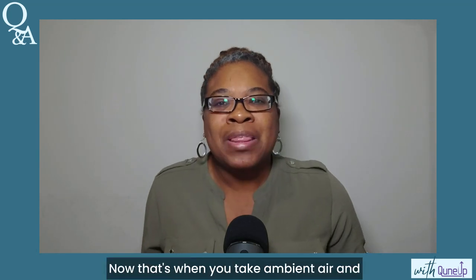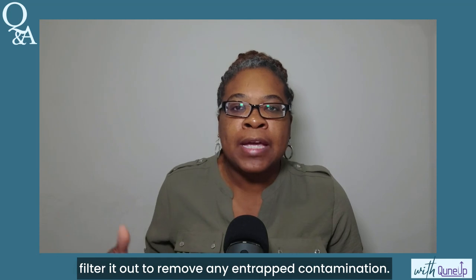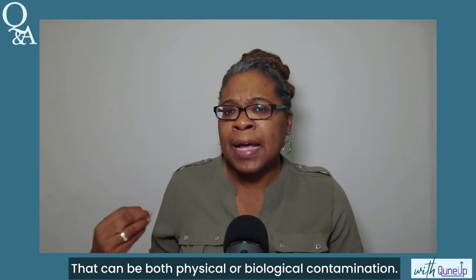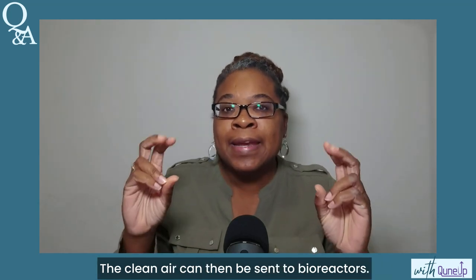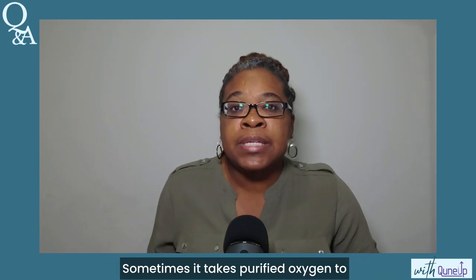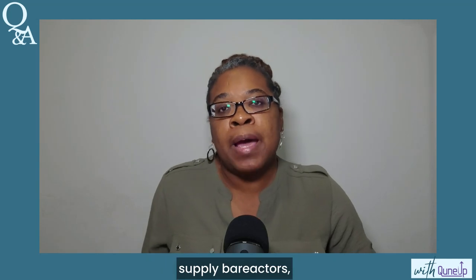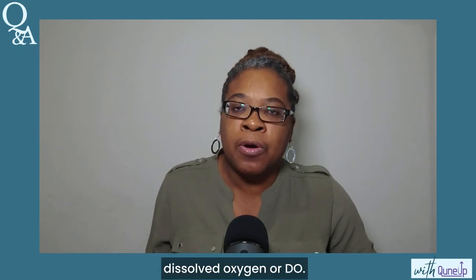Process air. Now, that's when you take ambient air and filter it out to remove any entrapped contamination. That can be both physical or biological contamination. The clean air can then be sent to bioreactors. Sometimes it takes purified oxygen to supply bioreactors, and that's typically called dissolved oxygen or DO.